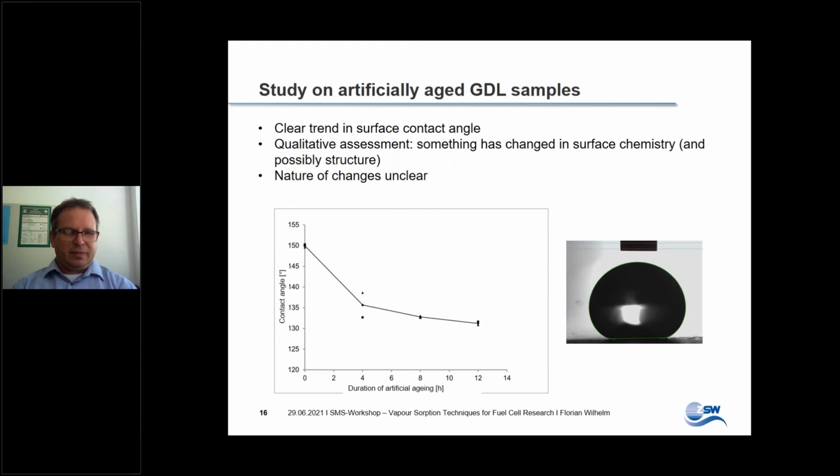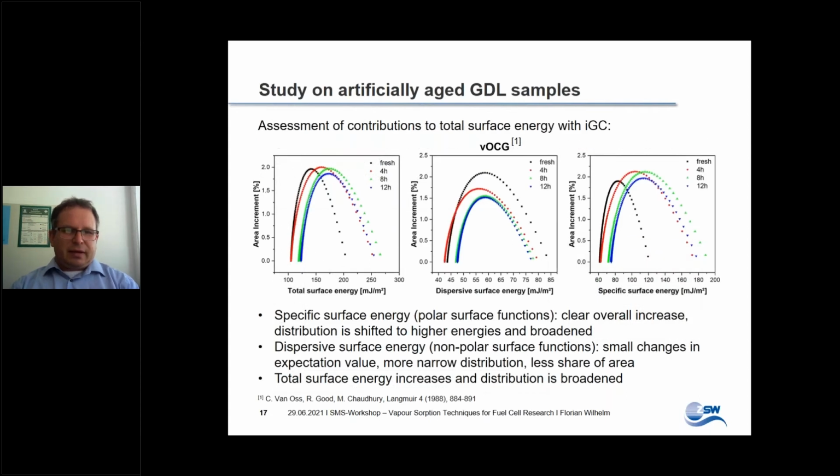And for this, we employ the technique of inverse gas chromatography. So what is the result we can get from inverse gas chromatography? We can assess the contributions to total surface energy with IGC. Maybe let's start from the right, the specific surface energy.